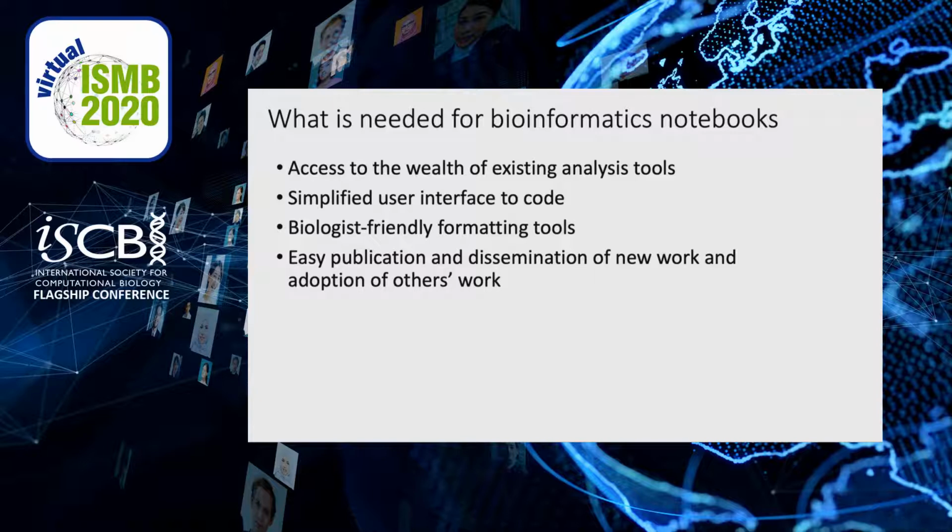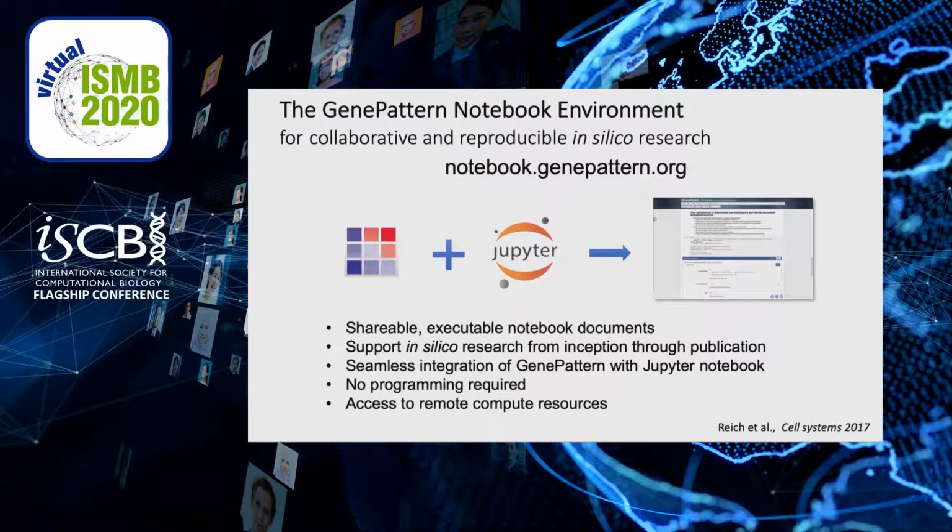The easy publication and dissemination of notebooks, because it would be ideal for other users not to have to download and run a notebook locally or to use Binder or a similar online service that limits a user's ability to run and modify a notebook to what can be done in a single session. And finally, for common workflows, users shouldn't have to start with a blank page. There should be templates supporting common bioinformatics analysis scenarios that scientists can easily adapt to their own objectives. These are the requirements that led to our development of the GenePattern notebook environment.